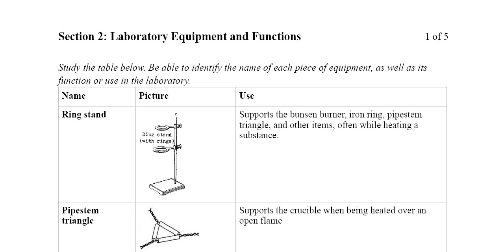Today we will talk about chemistry laboratory equipment and their functions.